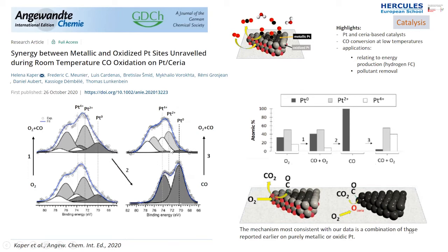So it shows that the sample is history dependent. What the gas was before the reaction conditions can influence the behavior.